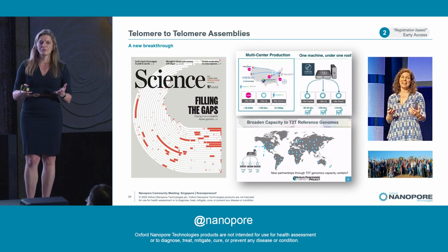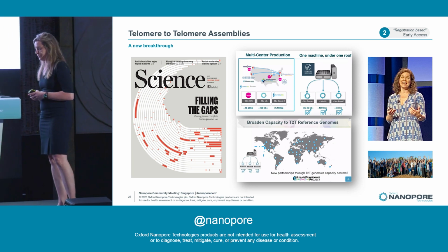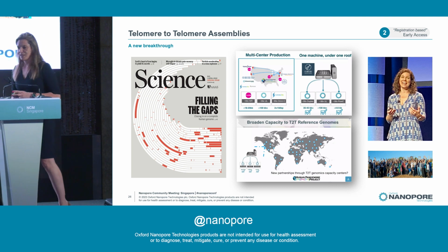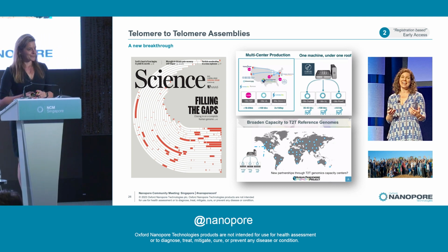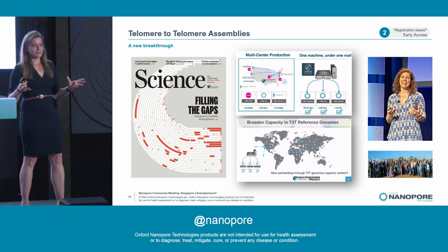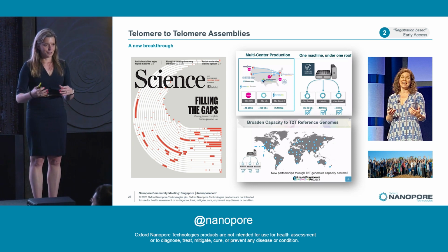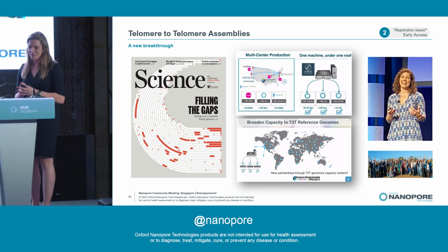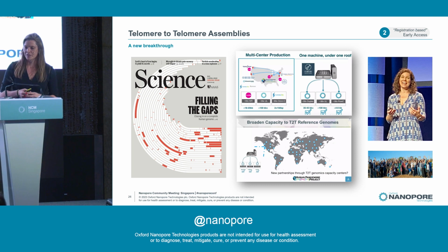So Duplex has become really exciting, really because of the dawn of the telomere-to-telomere genome. We've been discussing in a lot of the meetings today, assembly used to be a once-in-a-career occurrence. It's a little bit mental that you've now got projects that are attempting 300 T2T genomes, 1,000 T2T genomes. It's just really exciting to see what can come of a massive collaborative effort.